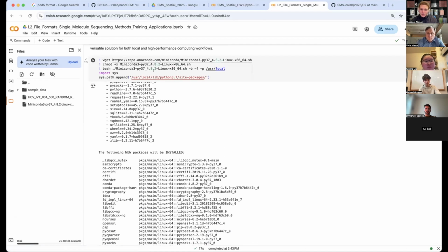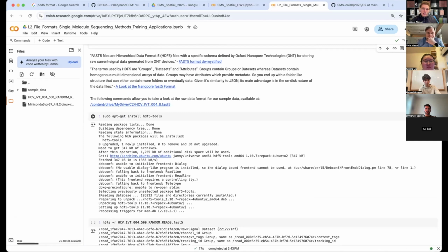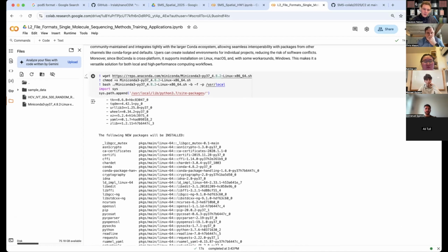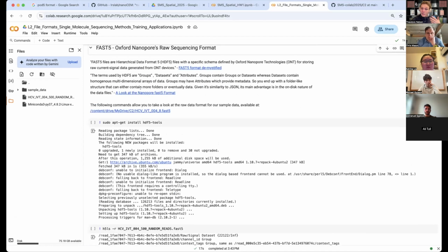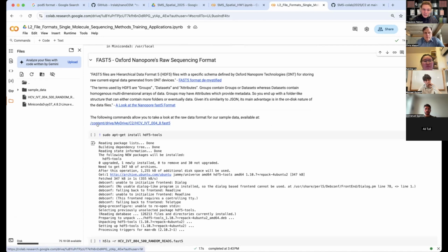The reason we've installed it here, I don't believe that this code creates any individual environments or separates all of the programs out, because all of their dependencies are compatible with each other. So there won't be a conflict. But that is the major innovation and the beauty of having something like Miniconda, which abstracts a lot of the details of dependency management away from the programmer or the user, and lets you focus on what you actually want to focus on, which in our case is the data.